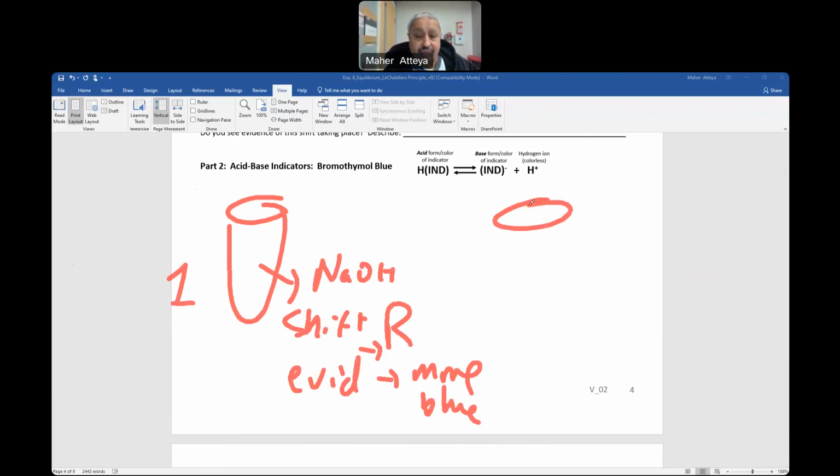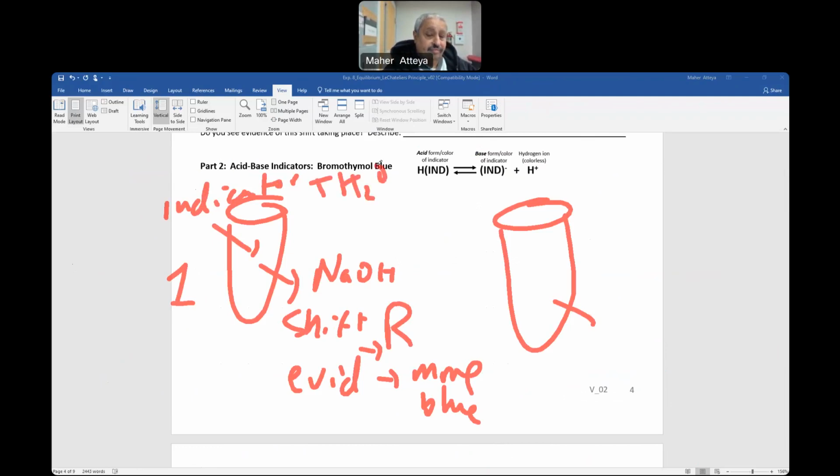Of course, I added the indicator and H2O here. Here's the same thing, indicator plus H2O. So I added HCl.